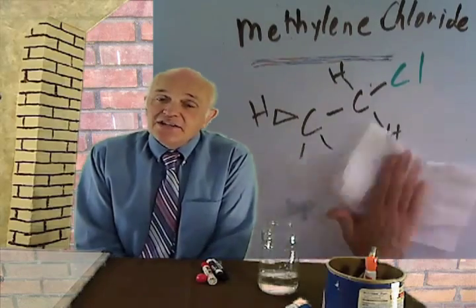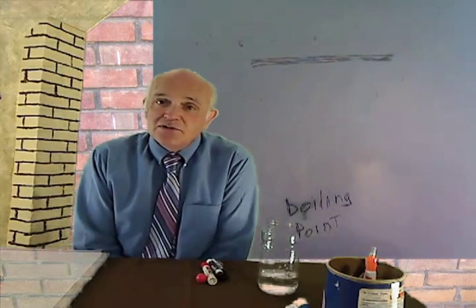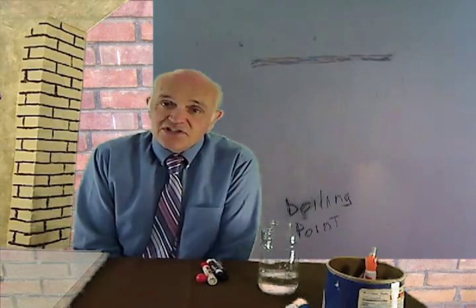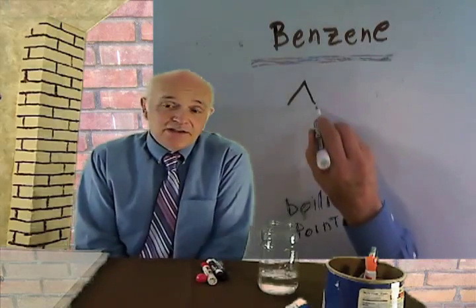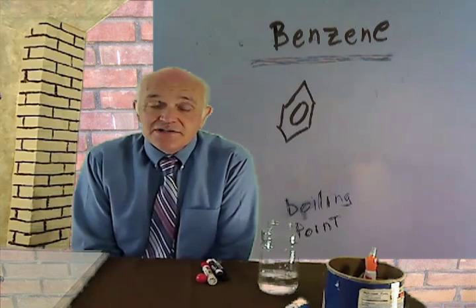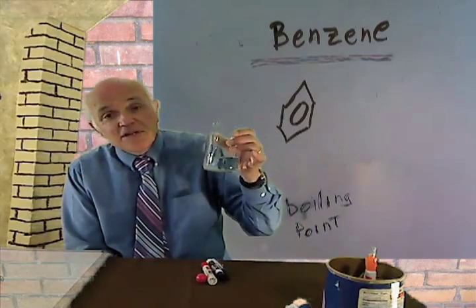The key to the concentration lies in the boiling points of the materials you're looking at. The semi-volatile is called the semi-volatile. The 8270 is called the semi-volatile GC mass spec. Semi-volatiles are things that boil, they will turn into gas, but typically at 100 to 250 degrees centigrade.